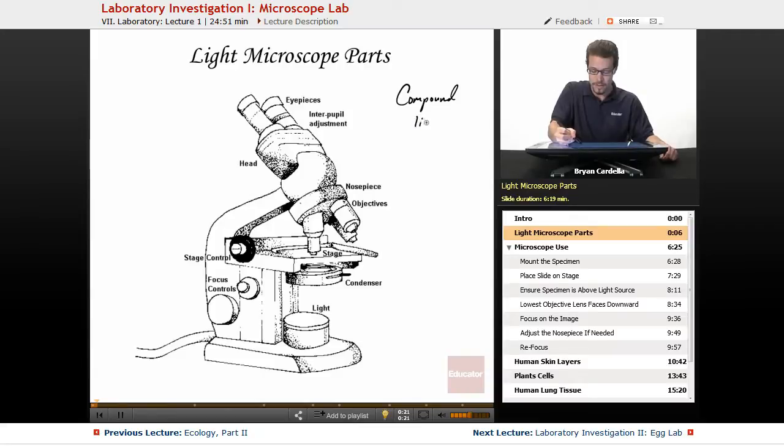This is technically called a compound light microscope because it involves numerous lenses where the magnification is compounded. The very first microscopes would have been one or two lenses, and then from there just got more and more magnified. The microscopes in an average classroom now are actually quite advanced, especially compared to a few hundred years ago.